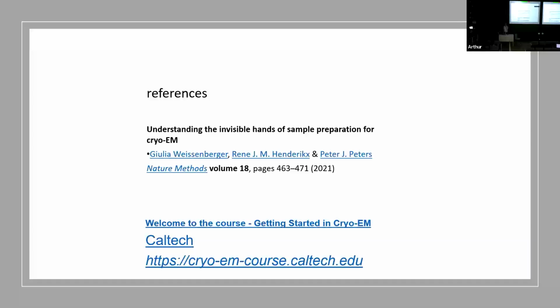Just for reference, if you're new to cryo-TEM, there's a good paper in Nature Methods, Understanding Sample Preparation for cryo-EM. And if you are going to be doing any cryo-EM analysis, you really should look up and watch the Caltech course concerning analysis of cryo-TEM images. It doesn't go into so much of the sample preparation and acquisition as it does the analysis after the images are taken. So it's good to have all that math in your hand and in your head when you're starting to take these images.